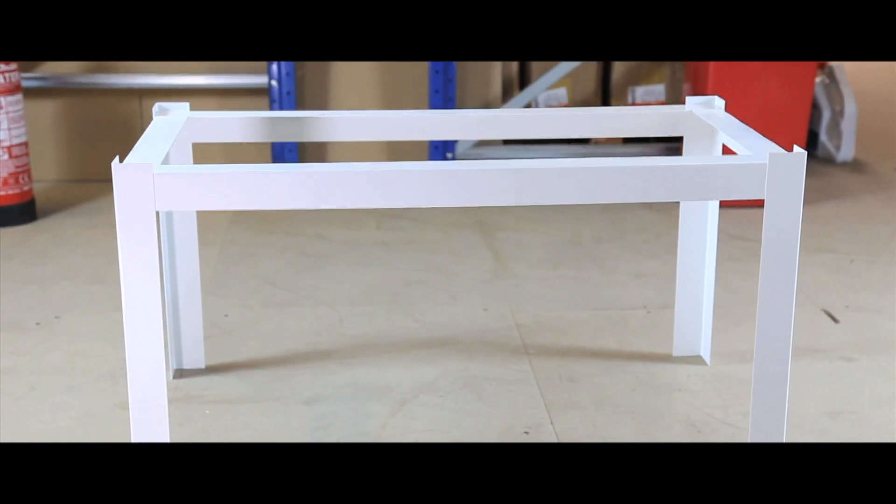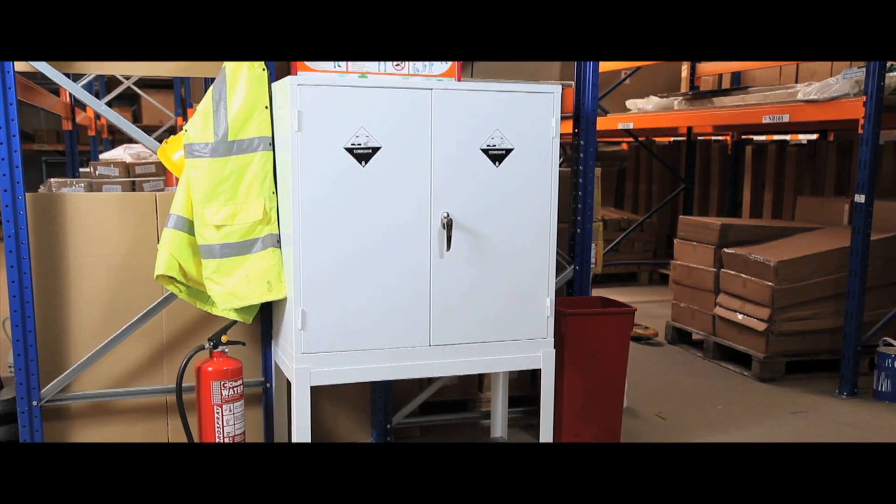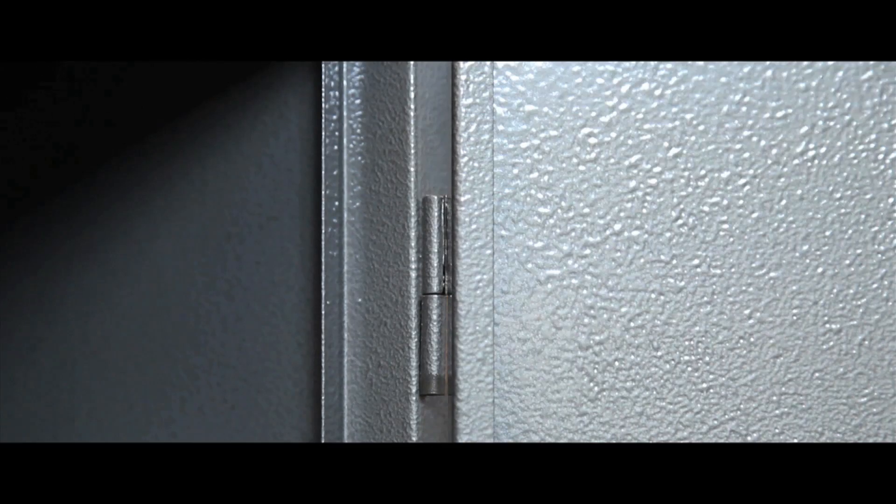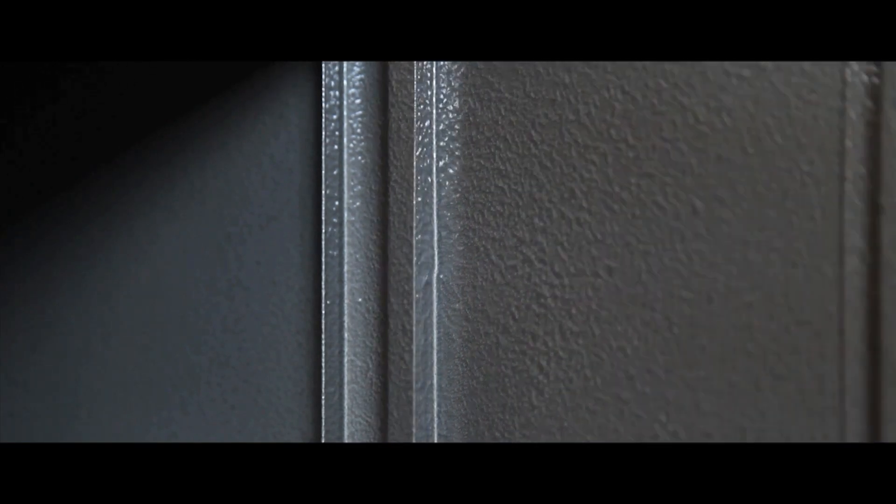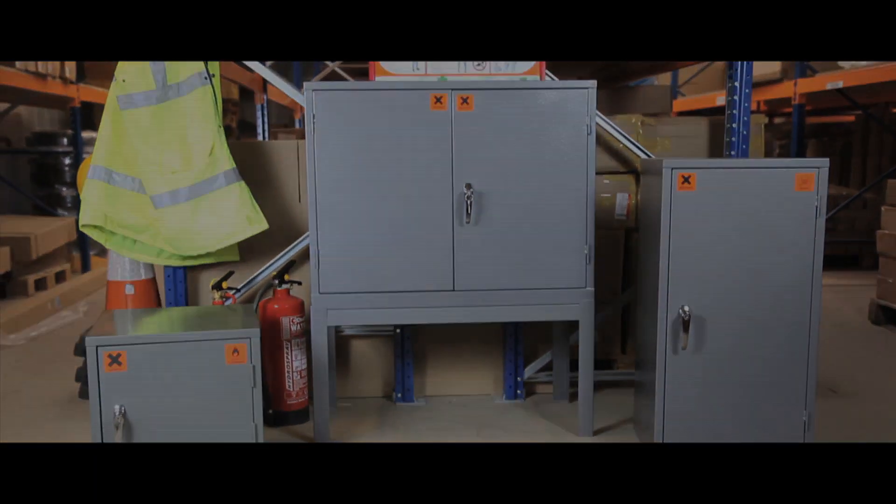Stands can be purchased for smaller sized units if required. Our cabinets comply with all legislation and factory inspectorate approval and are the only design that comes fully welded.